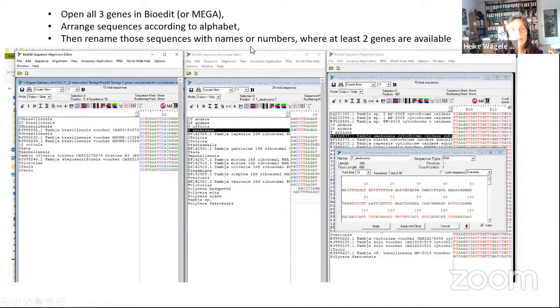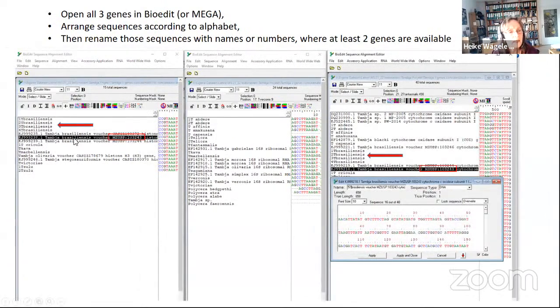So this is now a better overlap already between, wait a minute, this was the H3, this was the CO1, the 16S. So you have already 16S and another CO1 overlapping. And you go on like this. You realize that there is much more overlap between Brasiliensis and the CO1 Brasiliensis. So I renamed again 1, 2, 3, 4. I renamed here already, and I renamed these ones. They are really the same specimen. One is the same specimen as here. So you see this here.